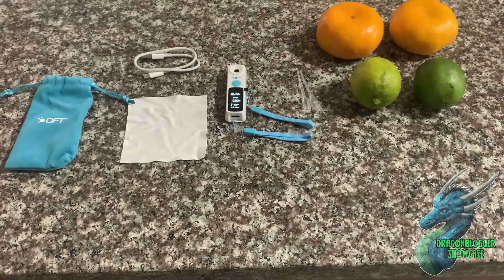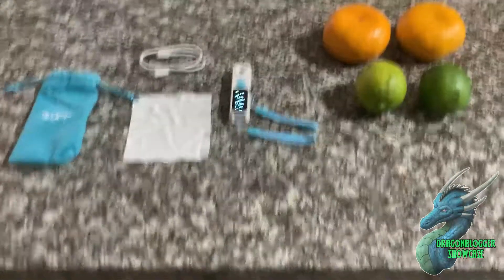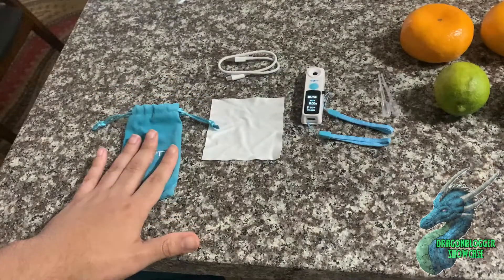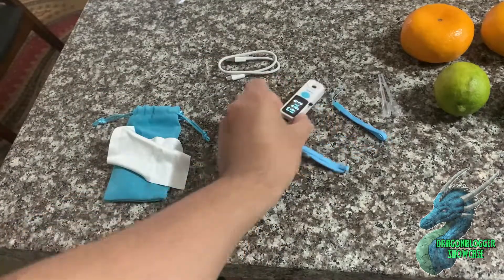I'm really excited about this. I've got my Diyfluid digital Brix refractometer to test the sugar inside of the fruits I have here. First I'm going to show you everything it comes with. It comes with a really nice carrying case made out of a soft felt-like material, and a little cloth so you can wipe off the screen of your digital Brix refractometer.